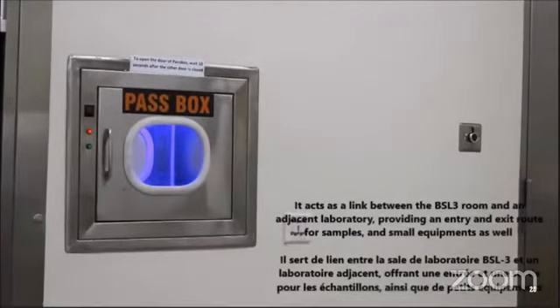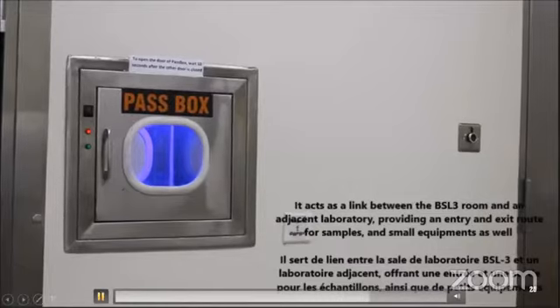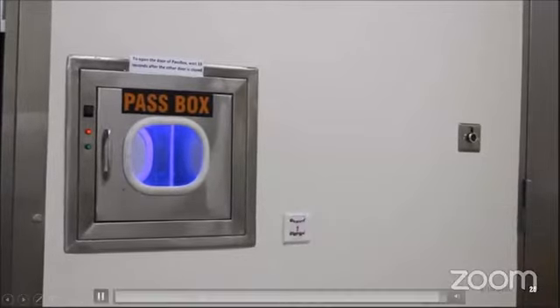By providing a passage route, it basically eliminates the need of constantly opening the main door, which would otherwise interfere with the directional flow and the negative pressure, hence compromising the containment. The pass box also has interlocking glass doors. It is equipped with ultraviolet light for the surface sterilization.